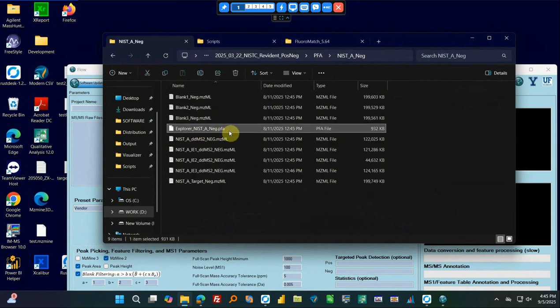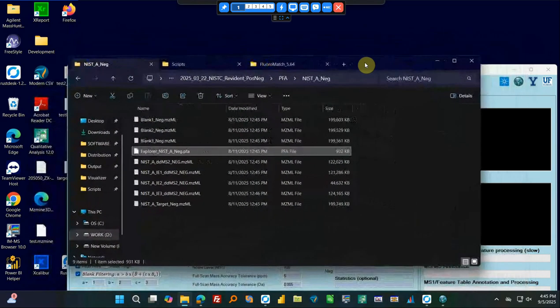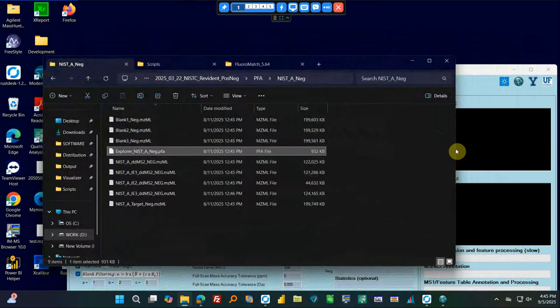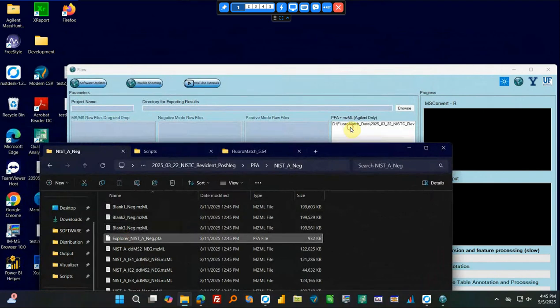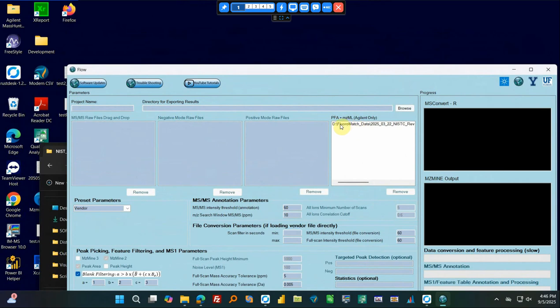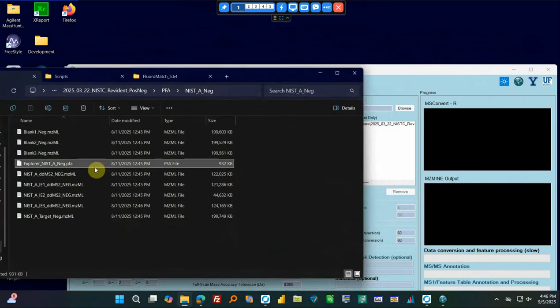So here's a .pfa file. In our previous tutorial video, we showed how to generate these PFA files. So let's grab that PFA file and drag it into the correct section over here. If the text is too small in this video, you can scroll over these boxes and a tooltip will come up that describes exactly what you need to put in each section. Notice that now all these other sections and many of the parameters are grayed out that aren't relevant for the PFA file.